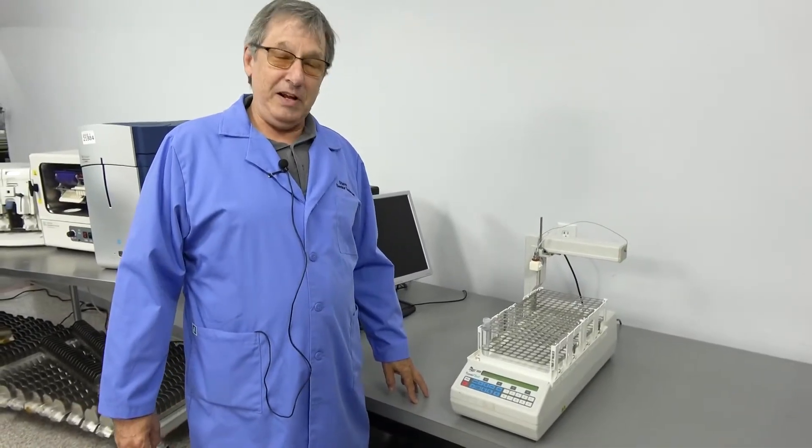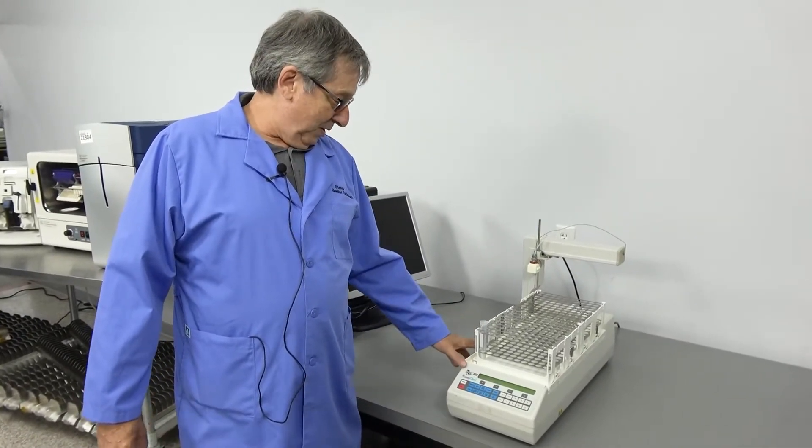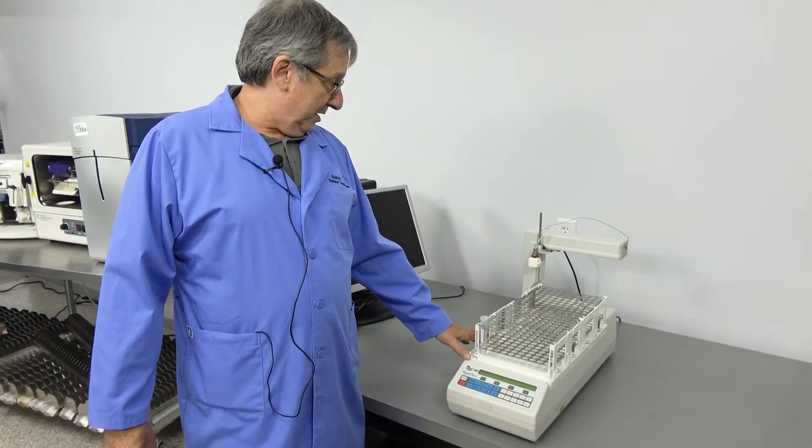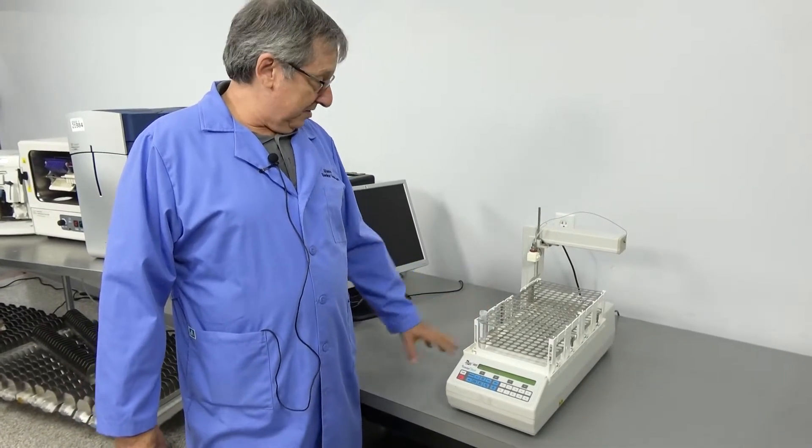Hello! Welcome to New Life Scientific. Today we wanted to show off the FOXY 200 CombiFlash unit, fractional collection system.